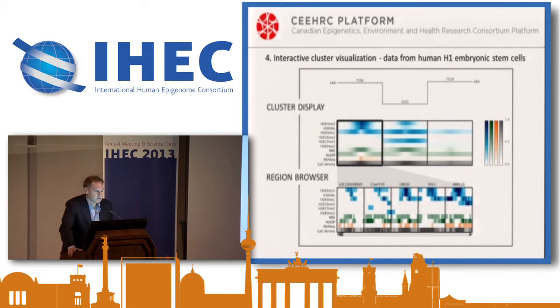So what we can see here, for instance, if we just take one cluster, is that there's one very clear set of promoters that, for instance, have accrued H3K4me3 and H3K9ac, and the other collection of promoters haven't to any great degree. And if we look at the RNA-seq, we have a readout from the cell. So this is the only cluster that's actually associated with transcription from those promoters. So we can quite quickly see what are the active promoters, what are the inactive promoters, and what are the different kinds of patterns that we see across the promoters within that particular cell type.